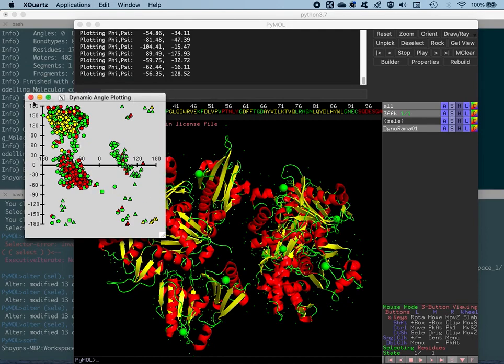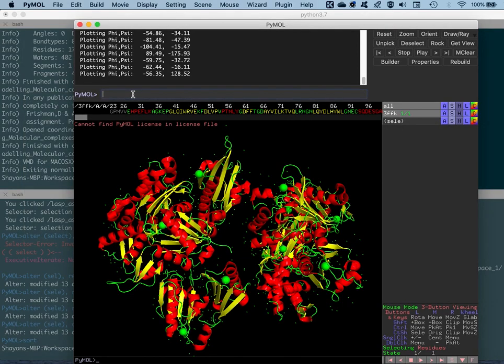what you can do is just close this again, and then we type in Rama all followed by none, which means we are not doing any kind of selection out here, and then a comma, followed by, let's say we give it a name, let's say rama_plot.ps. So once you do that, and if you're in the same workspace directory from where you opened PyMol along with the structure, you'll find that rama_plot.ps file is saved inside that directory, and you can open it with a PDF viewer, and then you can convert that into different formats.